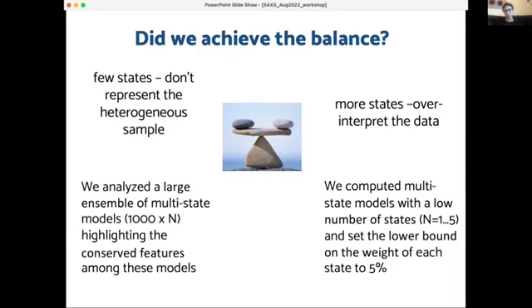So we will never say that the two states that are best scoring according to our score are the two states. But if we take 100 or 1,000 of our two-state models that we produced, this is already becoming representative of what is going on in solution. So I hope I answered your question.